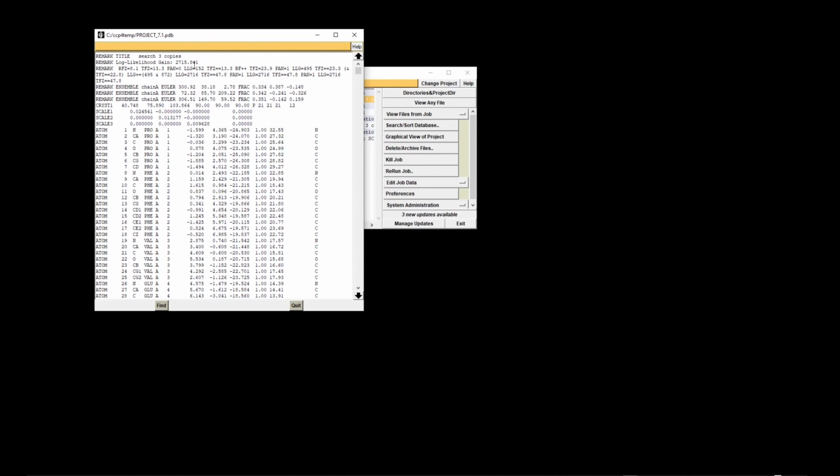So 2700 is quite good, so that's most likely right. We also get 2 Z factors, rotation factor Z and a translation factor Z. In our case here it's 8 and 13. Again, that's quite good. The scale used to be 1 to 7 of whether it would be correct or not, so these are clearly above 7. It also reports LLG and Z scores using different statistics, but these first 2 are telling.